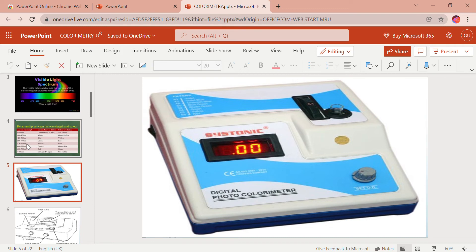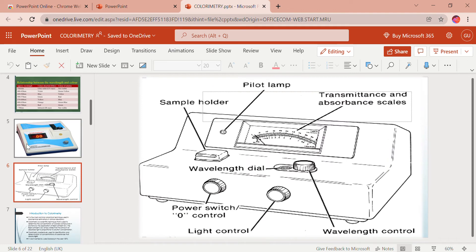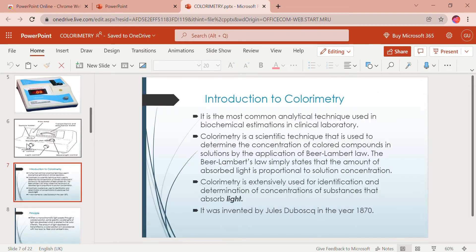This is a commonly seen and used digital photocolorimeter, usually found in hospital laboratories, research laboratories, and academic laboratories. The device is extensively used for identification and determination of concentration of substances that absorb light. Here is a diagrammatic version of the colorimeter — it has a wavelength control button and a sample holder, that is a cuvette. We will discuss the instrumentation later.